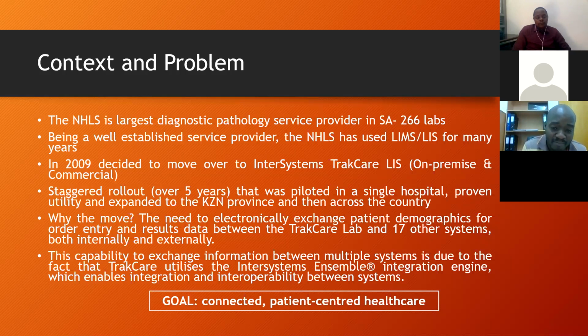So next to all public hospitals is an NHLS laboratory, and the main customer or client is the Ministry of Health or Department of Health.